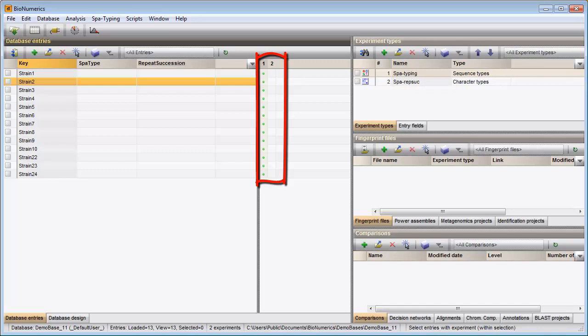Column 1 corresponds to my sequence experiment. A colored dot is displayed if a sequence is present for an entry-experiment combination.